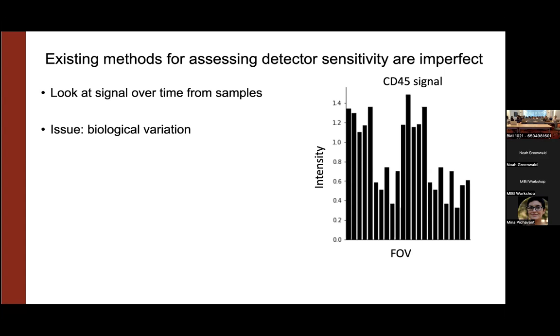And so just looking at the total CD45 signal, the intensity of the CD45 signal, the 99th percentile, any of these metrics you could think about, all of them are fundamentally confounded by the fact that either there's a change in cellular composition in your samples, or a change in marker intensity within those cells. All of these are interesting things that we care about measuring. The impact is going to be, oh, CD45 changed.